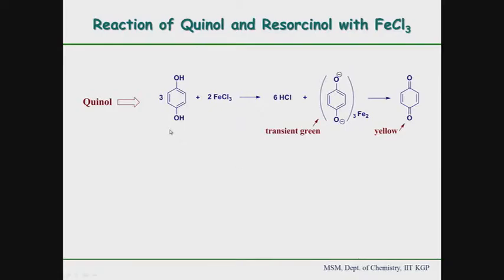We will do several reactions with ferric chloride. For the first sample, quinol — if quinol has this structure, it is easily dissolved in water. First we dissolve this quinol, let us say a pinch or one spatula, around 50 to 100 milligrams, in 1 milliliter of water. Then we will add ferric chloride solution to this.